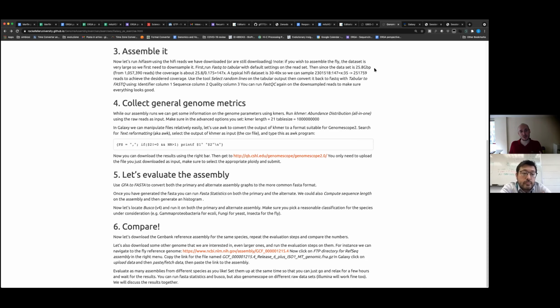And as you can see, you can compress in very short length a lot of options and things that need to happen, a lot of instructions to run. So maybe we can come back to this after when we look at your results, so you can compare before and after. But basically, can I add something, Giulio? Sure. So this step is going to reduce your big CSV file that contains like 5 columns, I think, into 2 columns, and the 2 columns are going to be the K-mer and the count of the K-mer. Yeah. That's the GenomeScope input.